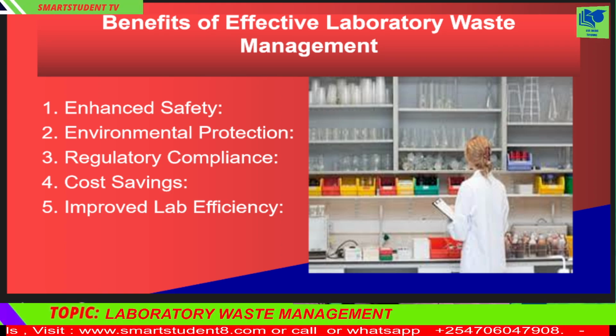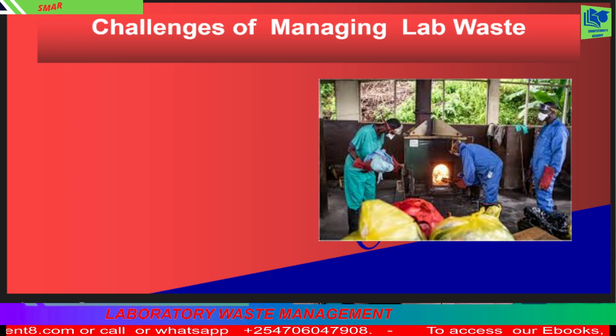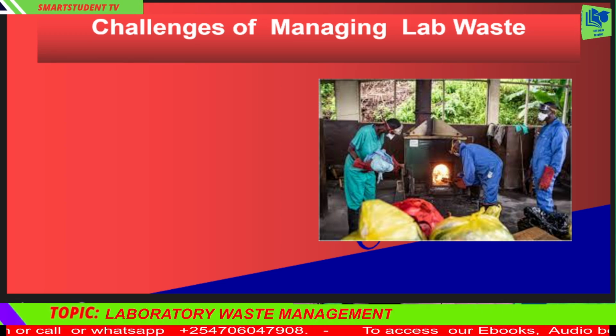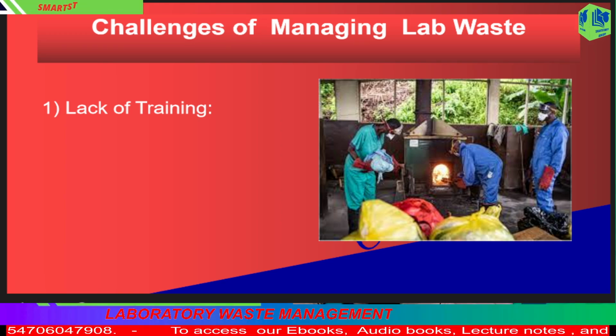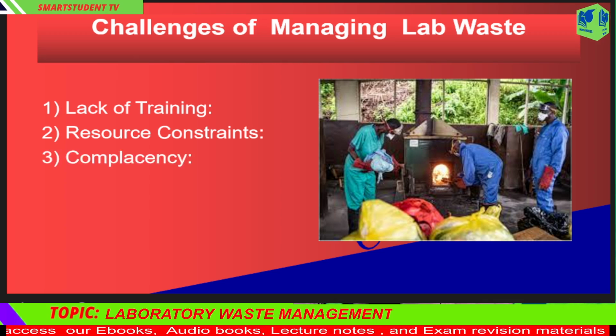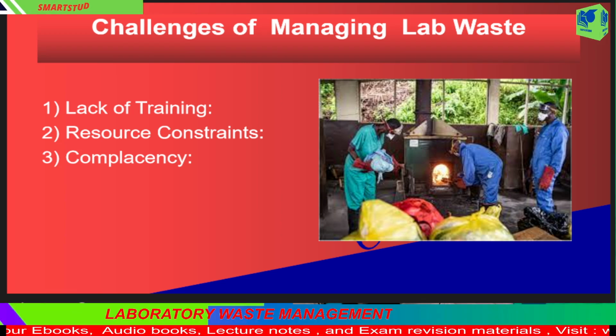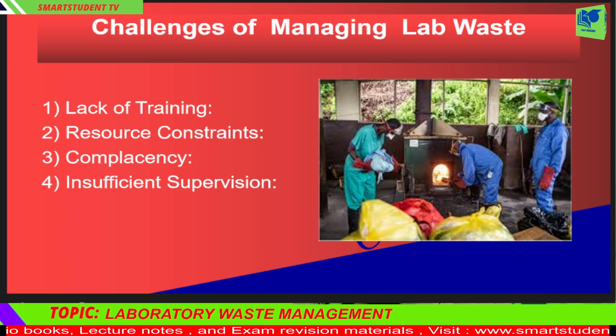Why some lab technicians do not properly manage waste. Despite the clear benefits, waste management in laboratories often falls short. Some common reasons include: 1. Lack of training. Many lab personnel are not adequately trained on waste disposal protocols. 2. Resource constraints. Limited budgets may restrict access to proper waste disposal facilities. 3. Complacency. In some labs, waste management is viewed as a low-priority task. 4. Insufficient supervision. Poor enforcement of waste management policies leads to neglect.